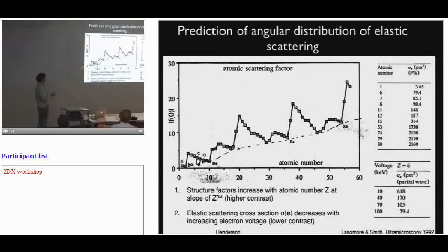However, if you compare this with X-ray, X-ray would have a much steeper slope. The reason for this is that the electron specimen interaction is different. In the case of X-ray, the X-ray beam interacts with the electrons only, and therefore people also speak of electron density. In the case of EM, we have the combined potential of the nucleus and the surrounding electrons, and therefore we are actually prohibited from speaking of electron density, but we speak of potential density or EM density in general.